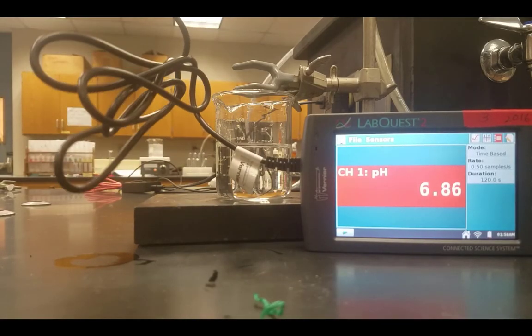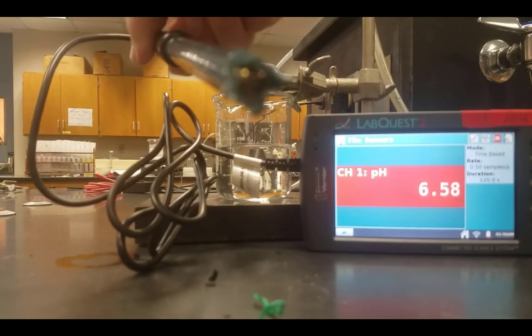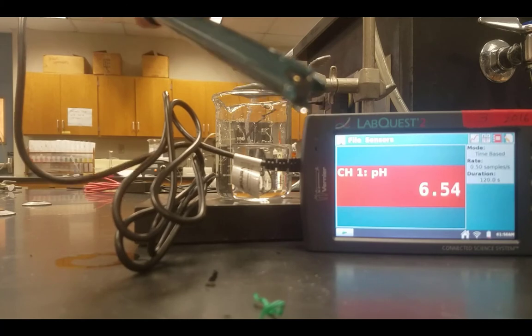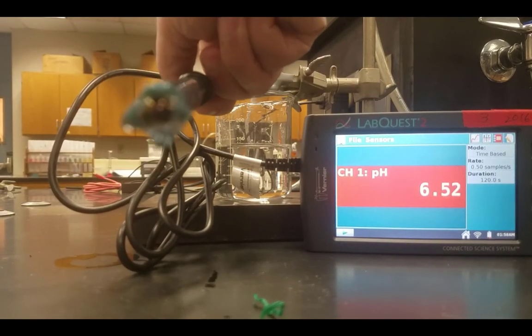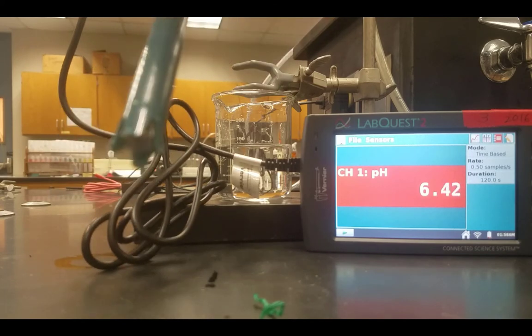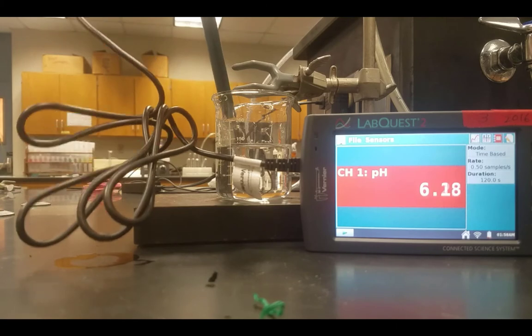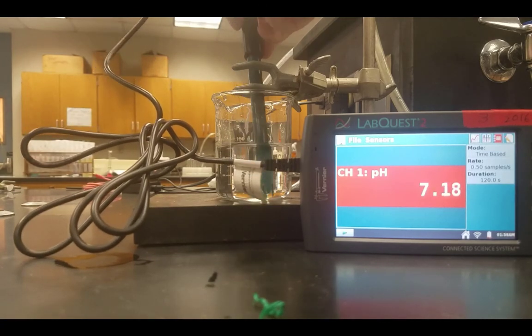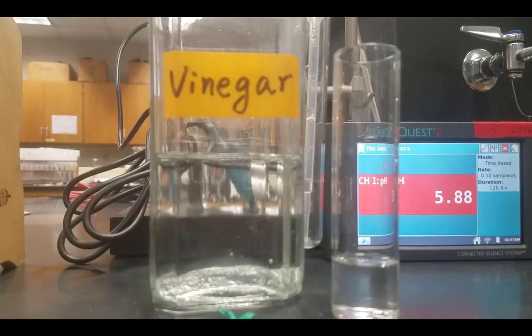Here I'm going to show you the pH probe. It might be difficult to make out, but there is a little glass sphere at the very tip of the probe, which is the essential part that is used for measuring pH. I'm storing it in water in between uses. You can read the pH values on the meter on the right.